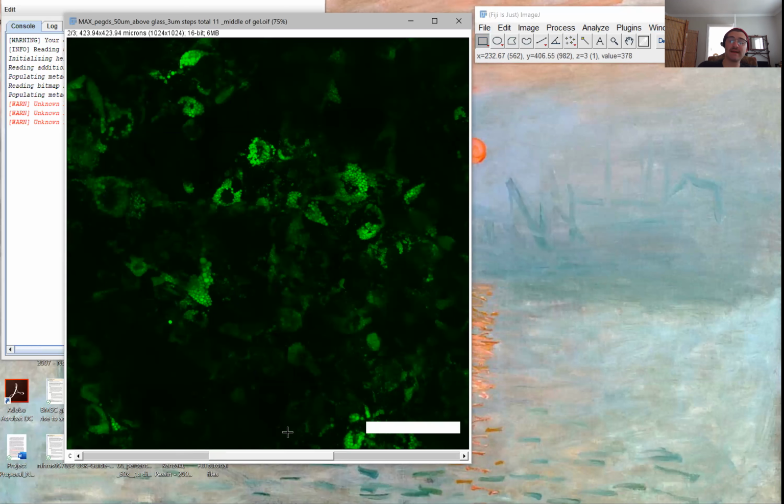If you did not already do the Z stack or the Z project, which I showed you guys earlier, it will have another pop-up bar that asks if you want to add a scale bar to each single Z slice. And then from there, you can either press yes or no.